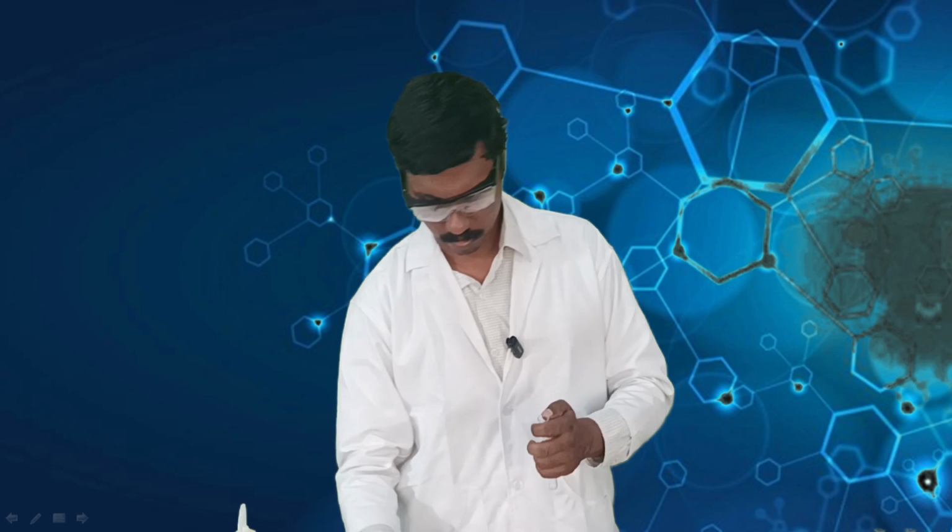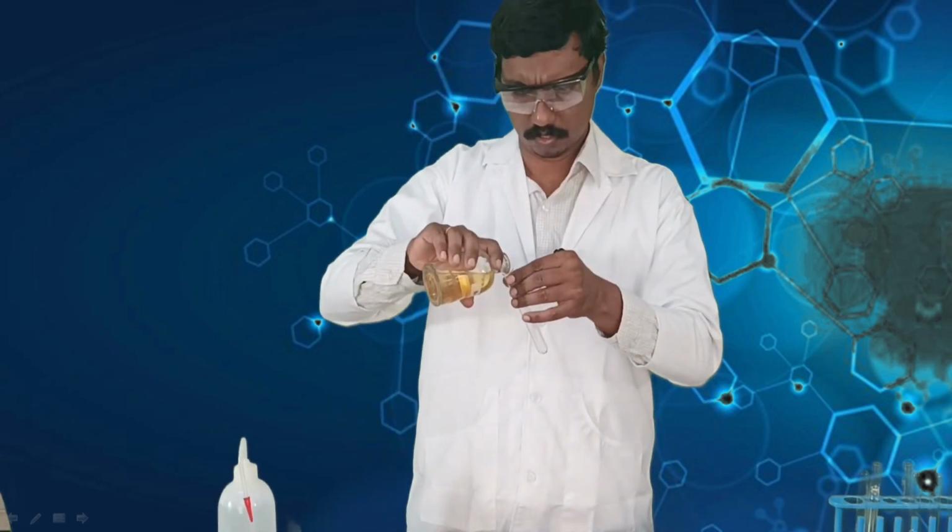The fifth test is for testing whether your given organic compound is a saturated or an unsaturated compound. For that, you just take a little bit of the compound in a test tube, and to this you add bromine water. If the bromine water, which as you can see is pale yellow in color, is decolorized, it tells you that the given compound is an unsaturated compound. That means there is a double bond in the given compound.